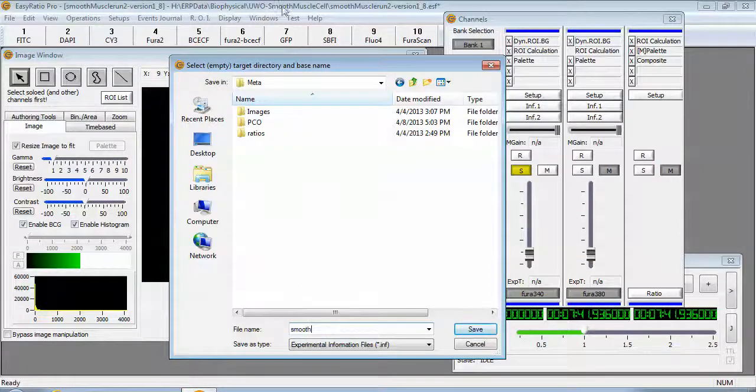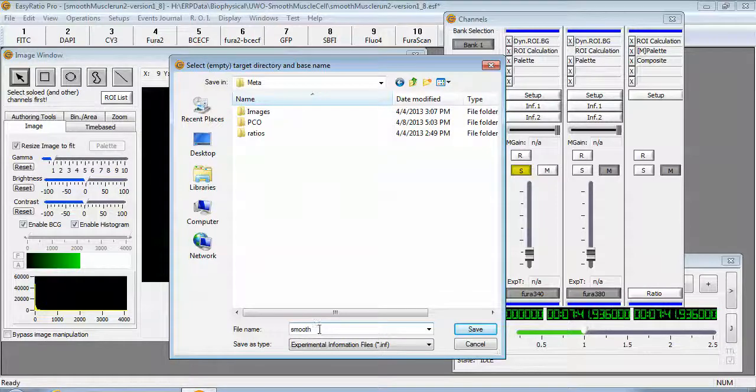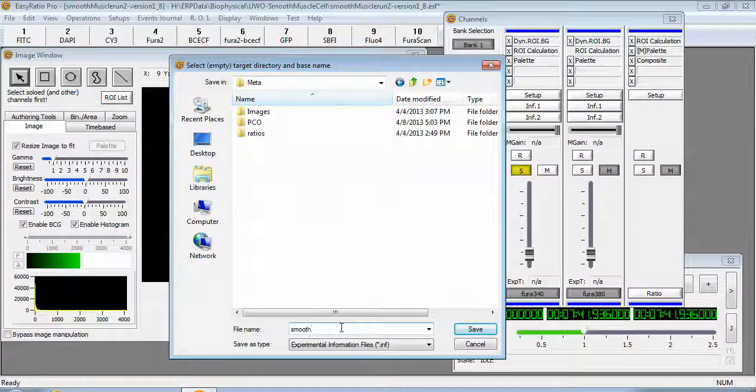The default name of the session will be truncated because Metafloor only supports short file names. So this one's going to be called smooth.